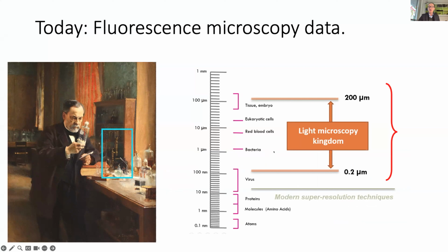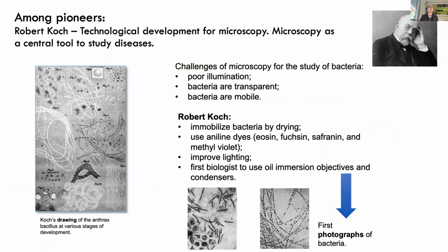In the case of infectious disease, actually, this is very interesting because you get bacteria, but you also get the host cells and so on. You miss the structures of viruses, but other techniques and other technologies are there for that. So imaging for infectious disease, it's always been a love story.